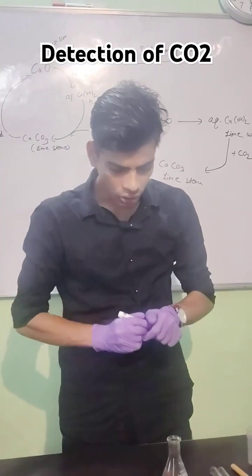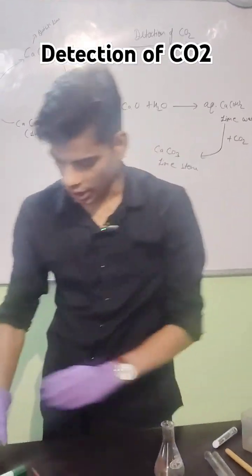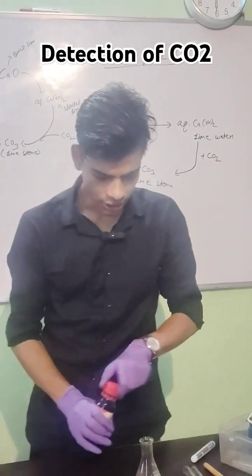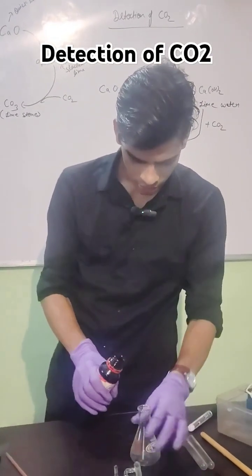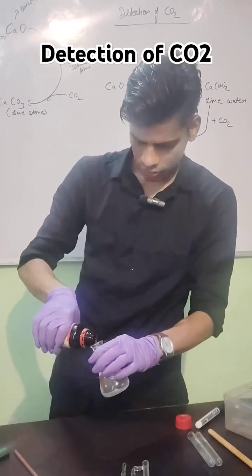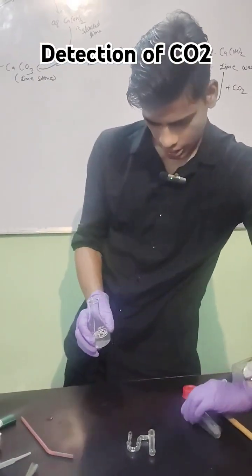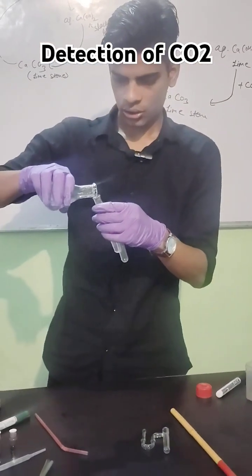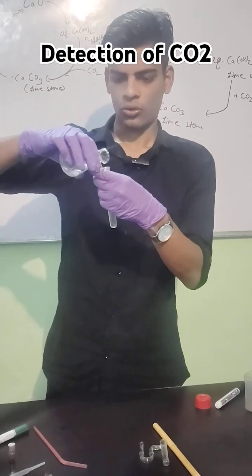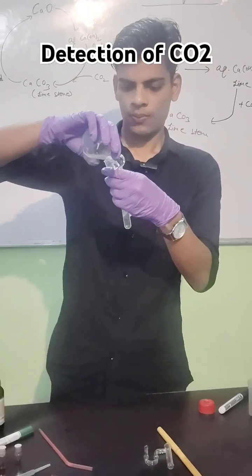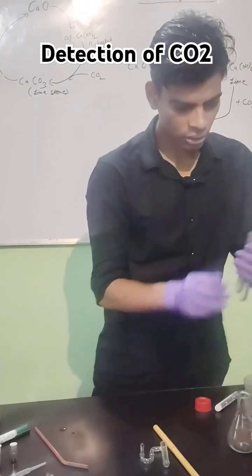So I am going to show you the experiment. You can observe here, this is your conical flask. And in this you can see, this is lime water. Both have a transparent color.